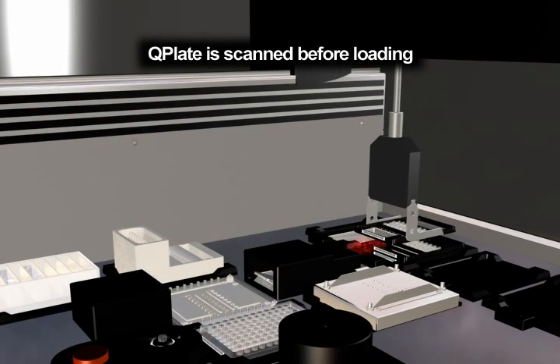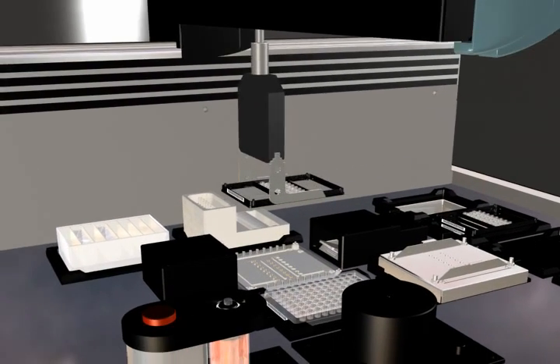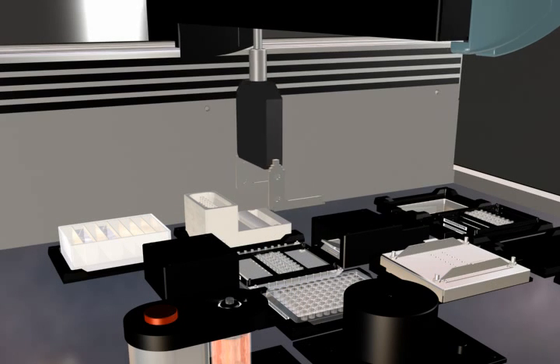The 16-channel Q-Plate electrode array is then picked up, scanned, and placed on the recording area.